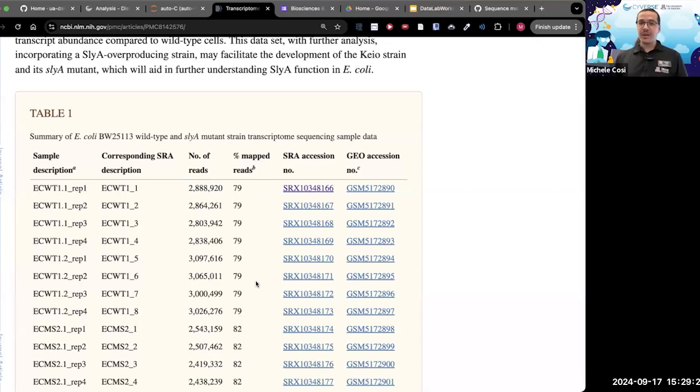Randall, I think you're onto something here with the accuracy dropping the longer the read. I do, however, think that accuracy with longer reads should be more than the 79% mapped over here. Usually, if you're using PacBio, for example, and not a nanopore, you will get roughly 90 to 93%. And with nanopore, you get an average of 80 to 90%. Maybe the fact that these reads are so long through an Illumina machine may be the reason why the mapping is at 79%. And yes, if these reads were shorter, this would be able to map a lot better. And that's why Joel earlier was saying you should trim the reads first. Thank you for the question, Randall.